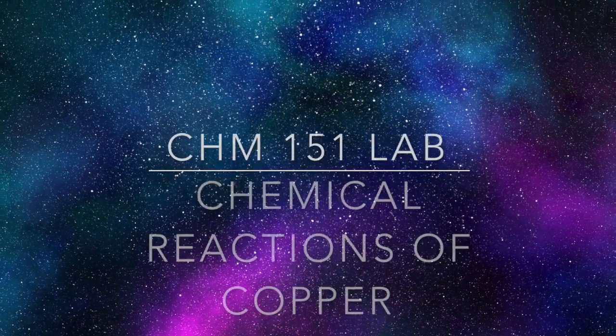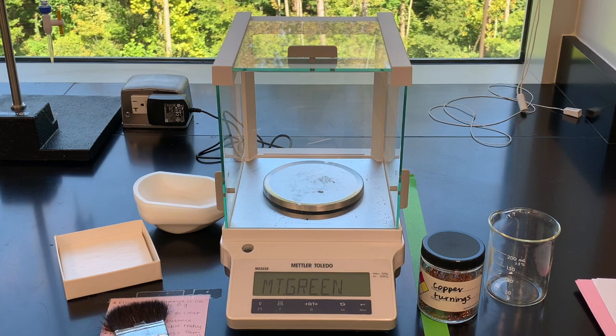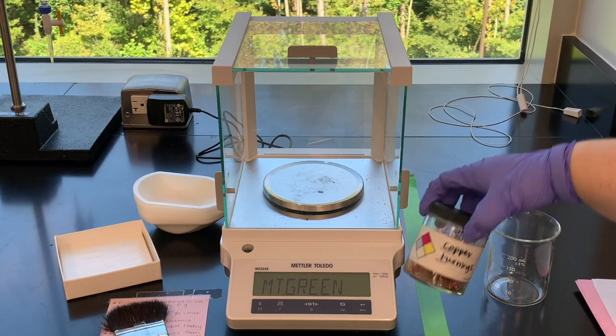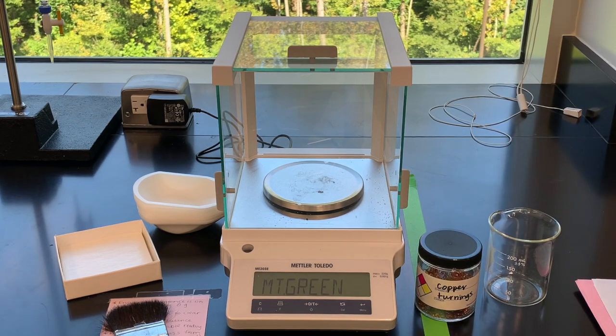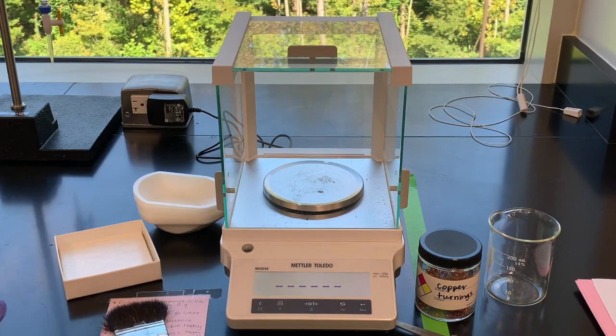Today's lab is the chemical reactions of copper and percent yield. So the first thing that we're doing here is we're going to measure out about 0.5 grams of the copper turning. So I have those here. I also have a pair of scissors just in case I need them. Make sure that you record the exact mass of these copper turnings in the appropriate place on your report sheet.